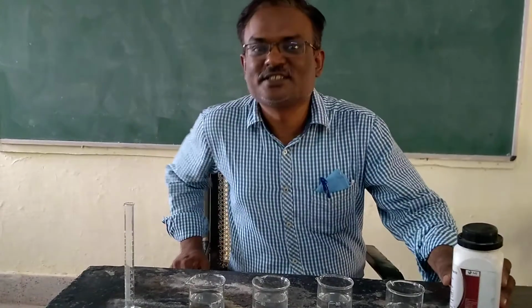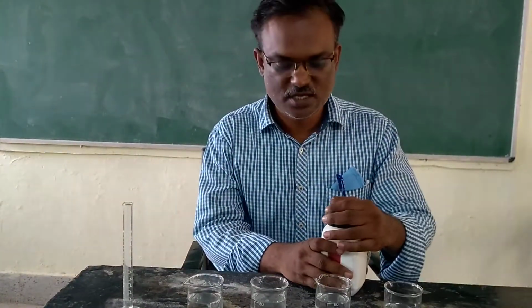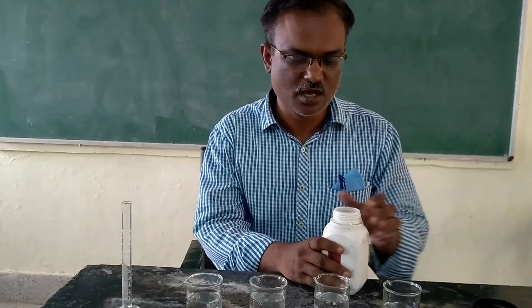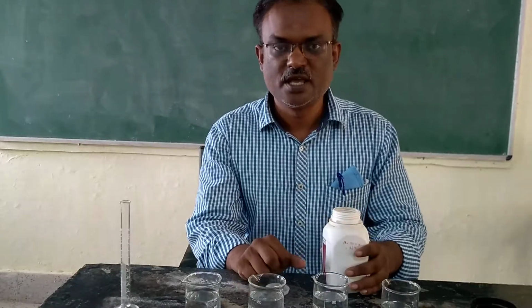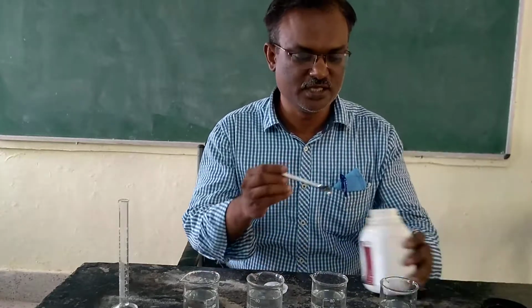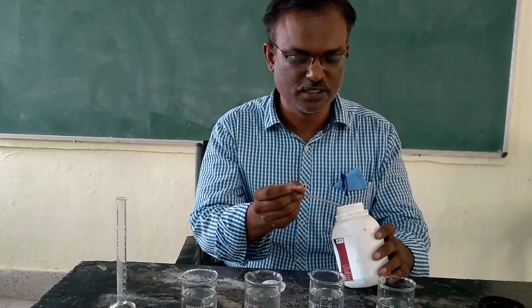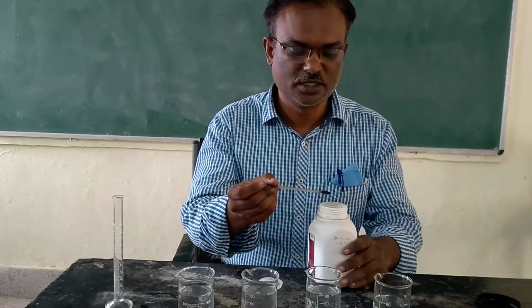Hello students, good morning. Now we are going to study one of the activities, that is the activity of dilution of the potassium permanganate. As you know, potassium permanganate is a crystalline substance, and you can see that it is a very finely divided powder.